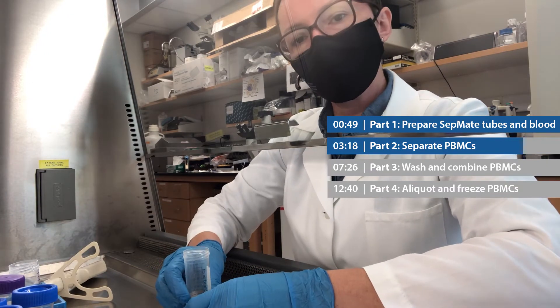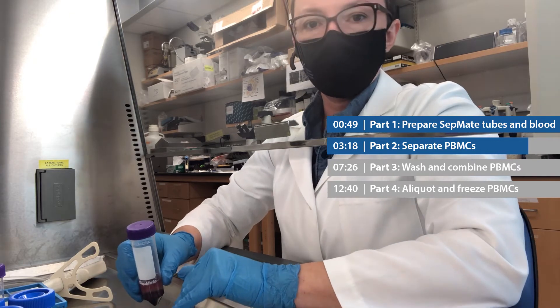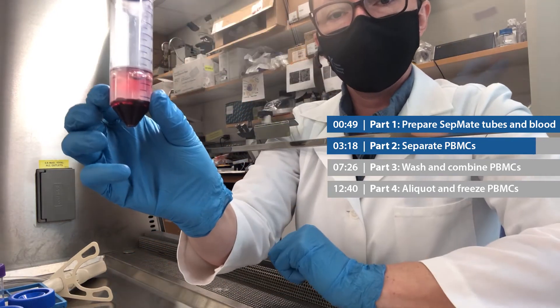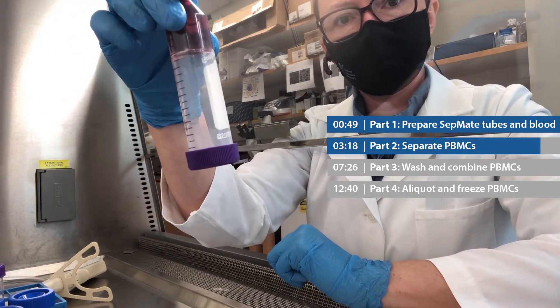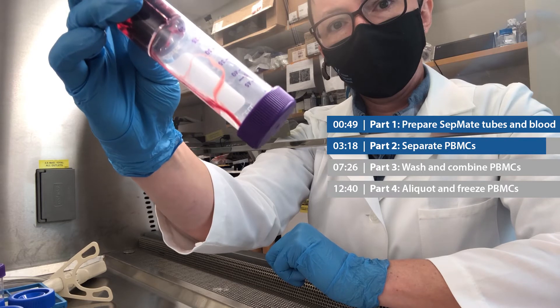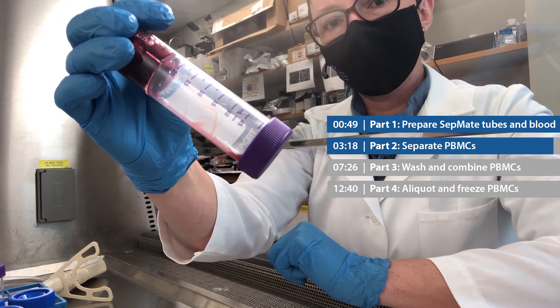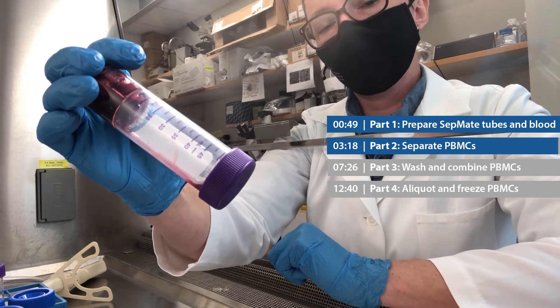Now I just want to take a moment to demonstrate what happens when you don't pour off your PBMCs in that smooth, confident motion. Here I have the SepMate tube that just has the red blood cells left in it. If I turn it upside down, nothing comes out. But if I hold it at a 45 degree angle, you can see the red blood cells start to flow out. This is where we want to avoid holding the tube at this angle while pouring off our PBMCs, because it might cause red blood cell contamination, which we're trying to avoid.